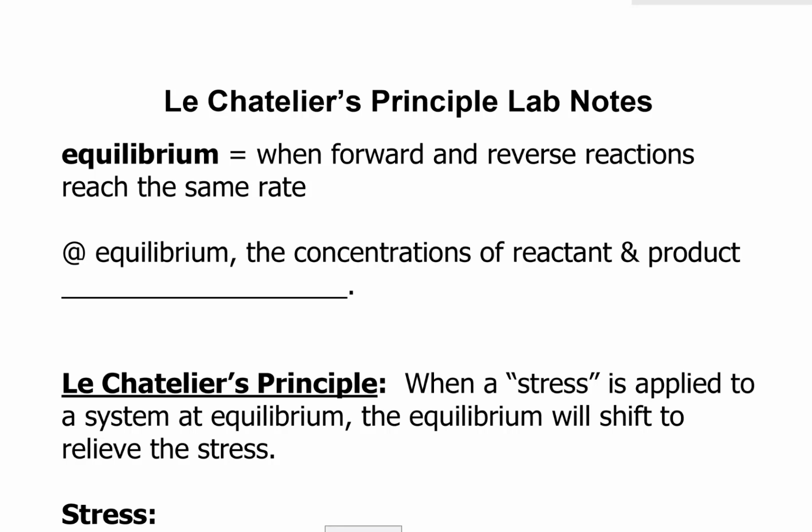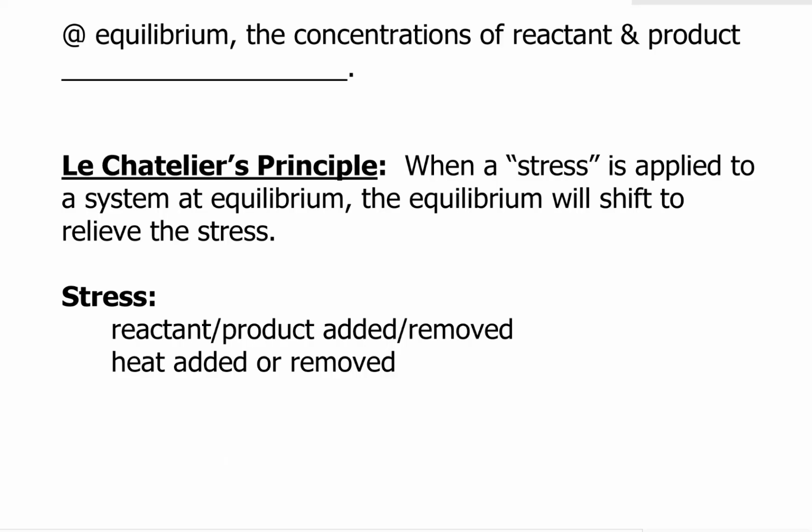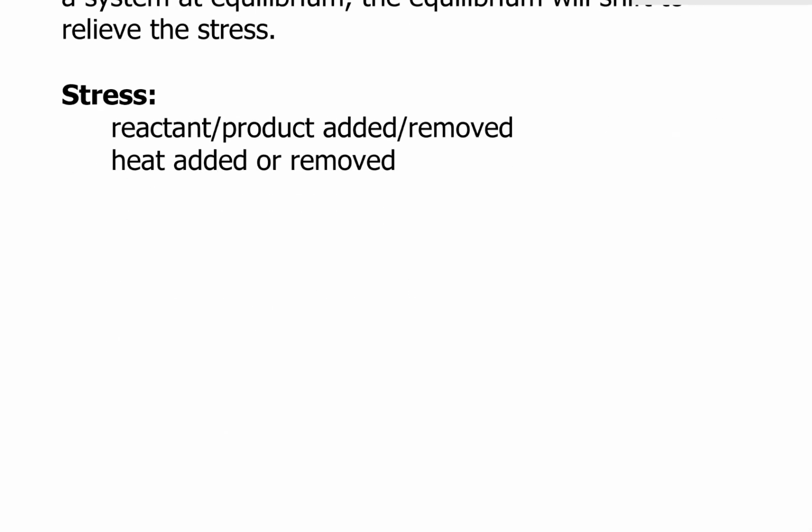We've already seen a physical equilibrium, and in this experiment we're going to look at chemical equilibrium. So to start, I'm going to consider the equilibrium that we already know about, and that was when liquid water is at equilibrium with its vapor.